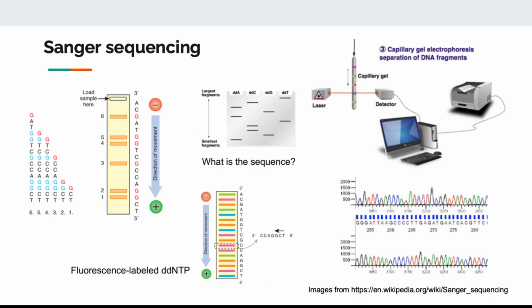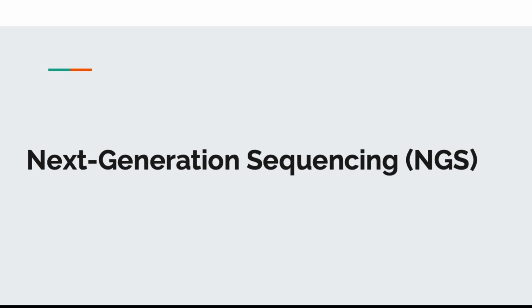But this technique is still good if you want to confirm a short sequence, like if you design a vector, or if you design a primer in the lab. This can give you a confirmation that your design is correct without having to send it to full-scale sequencing. So it's still in use today in the lab.